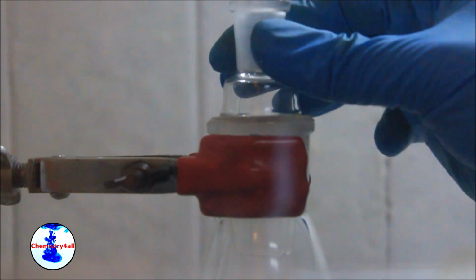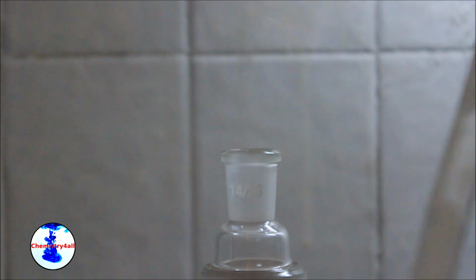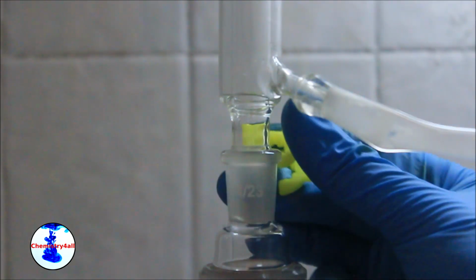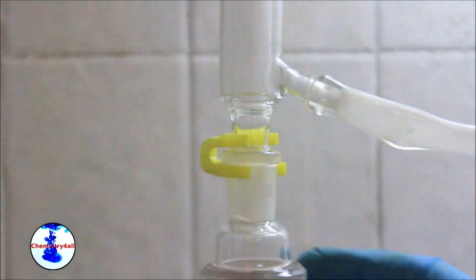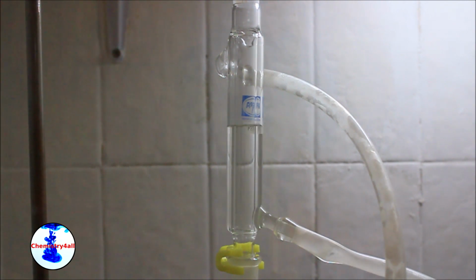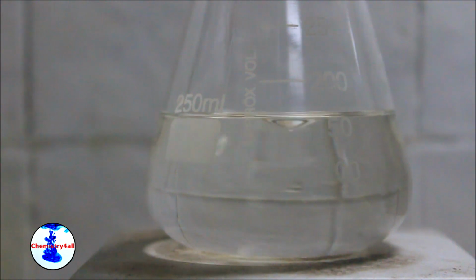In the meantime, a male to female adapter is attached to the reaction flask. A small reflux condenser is then attached to the system. And finally, a nice and steady flow of water can be established through the condenser. The reaction mixture is then heated up to reflux.